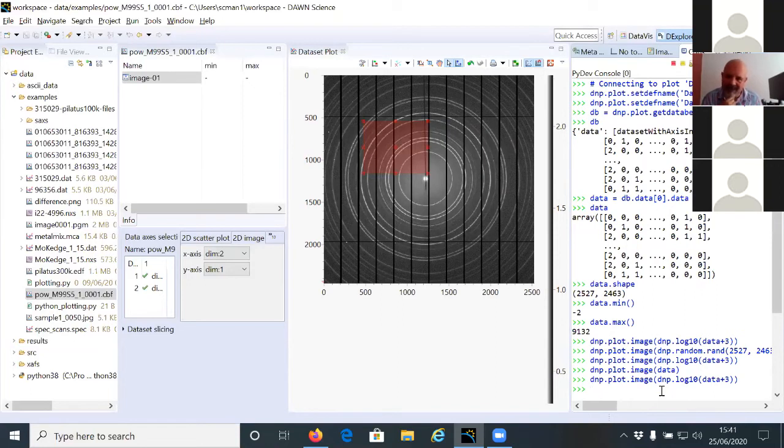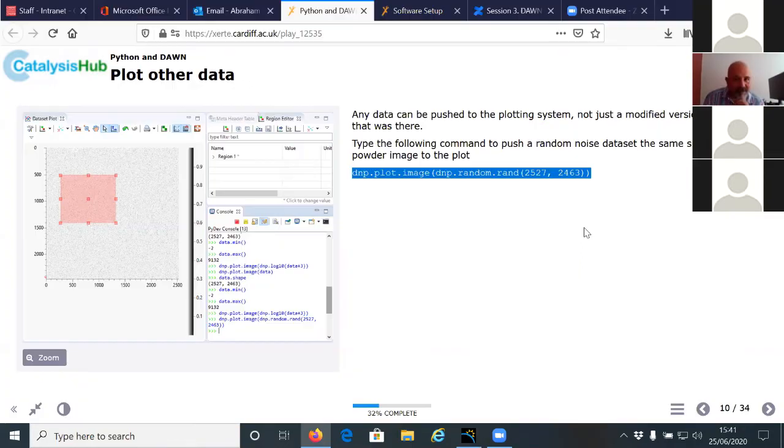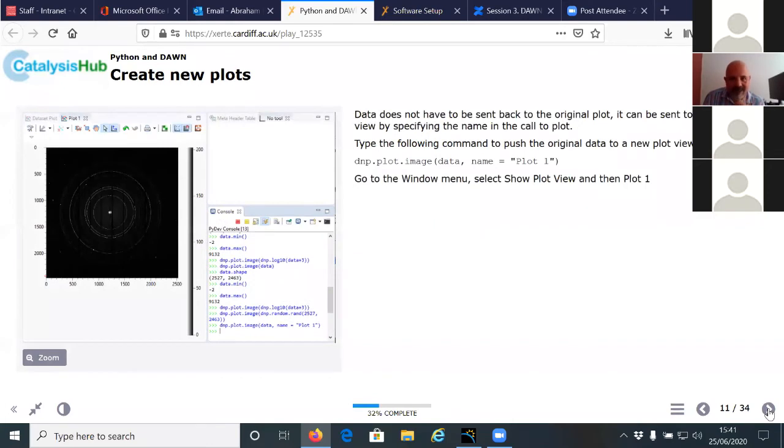But I'm more interested in removing the noise. But that is maybe denoising. Yeah, no, you can do other filtering. Okay, that's fine then. Thank you. Any other questions so far? If not, we move on to the next slide.